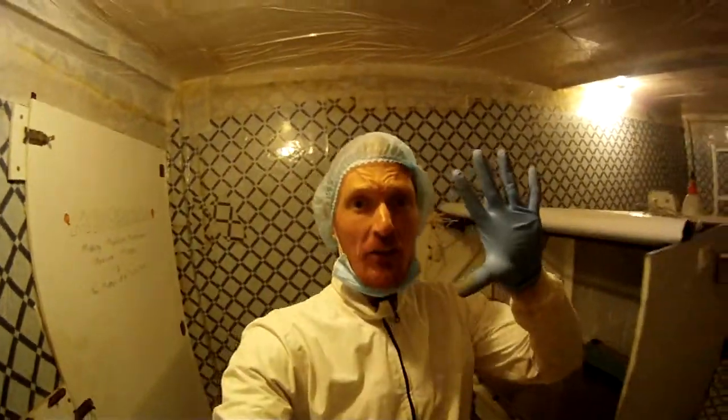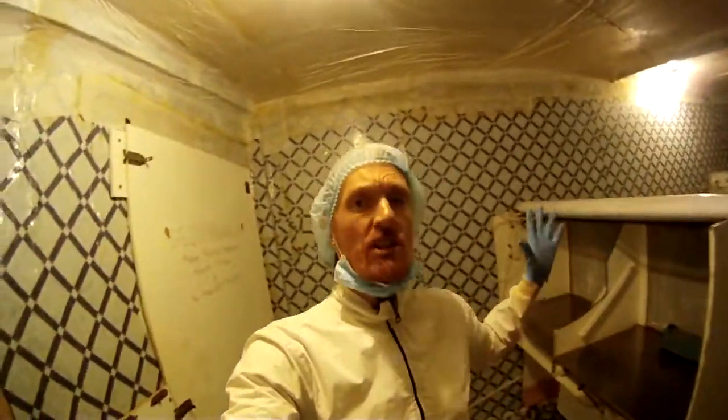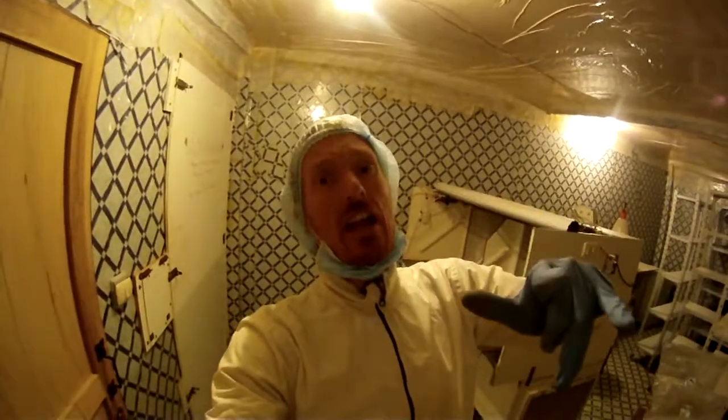Howdy ho gang, it's Talvin here. 5D Lifestyles. We're doing some 5D fungus. I'm giving you a little tour of my fungal operation here, seeing the components and infrastructure that it takes to grow mushrooms, at least on a commercial level.